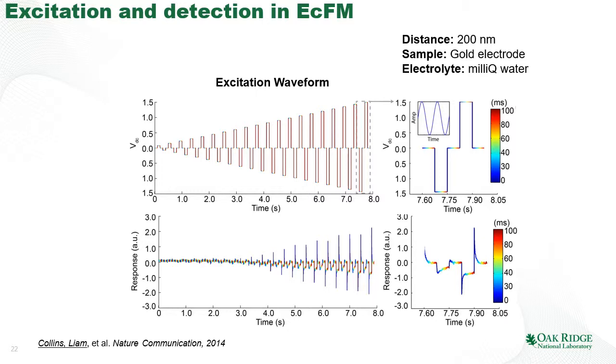If you look at this data, you can see it even better. You can see that the AC response after the bias pulse shows some relaxational dynamic. And if we increase the magnitude of the pulse, then the process becomes much more pronounced.